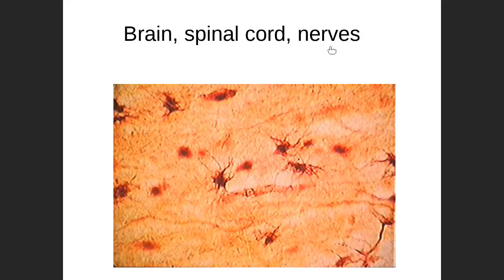Well, that's it for all the slides for identification of tissues. I know it seems like a lot. That's why I'm recording this for you folks, and you can take a look at it at your earliest convenience again and again and again.